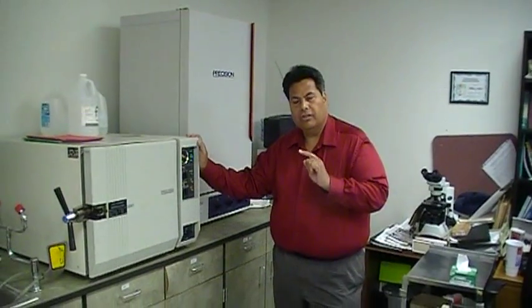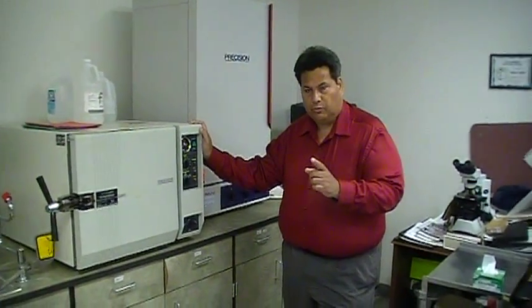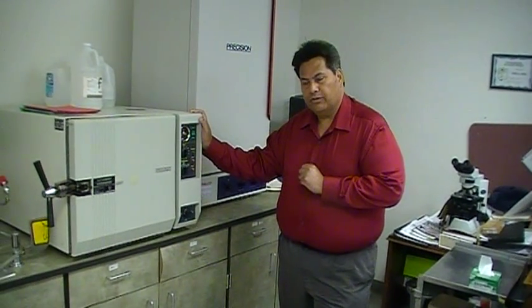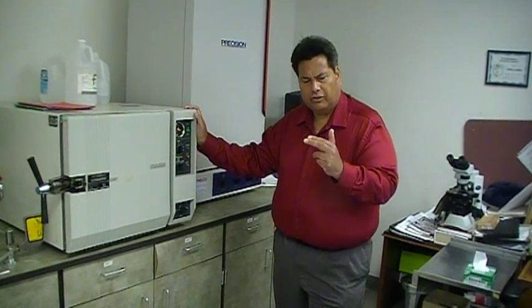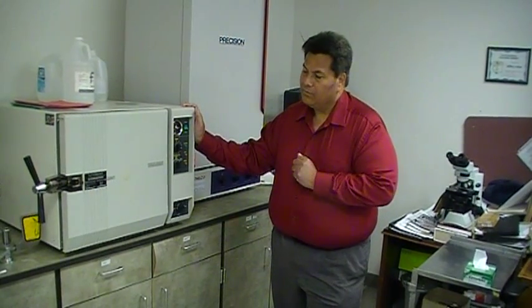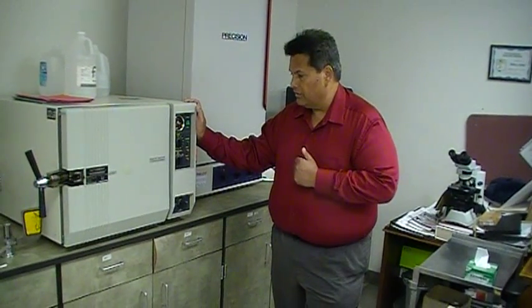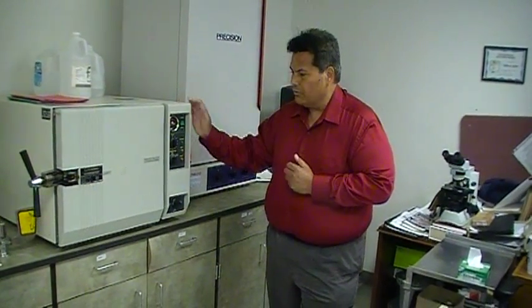Now we're going to show you how to sterilize solution the third way. Remember, we use the syringe to filter sterilize small volumes of solutions. We use the tabletop filter to sterilize larger volumes of solutions that cannot be autoclaved. And now we're going to show you how to use the autoclave to sterilize solution, small volumes and large volumes.